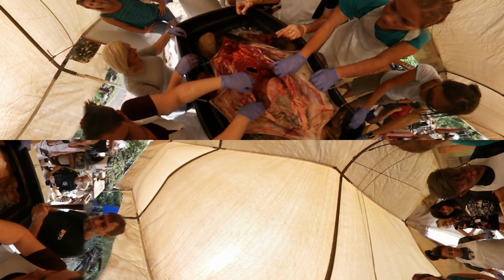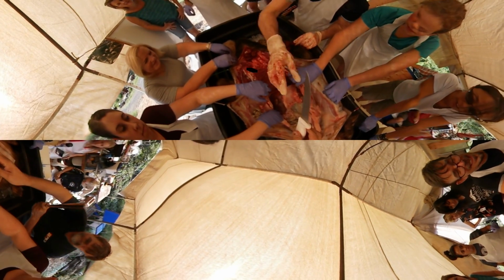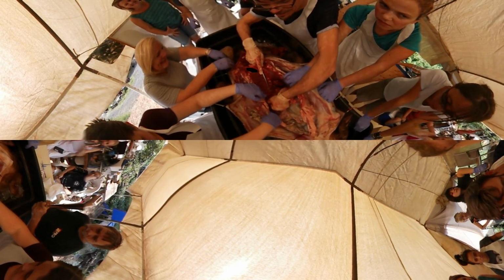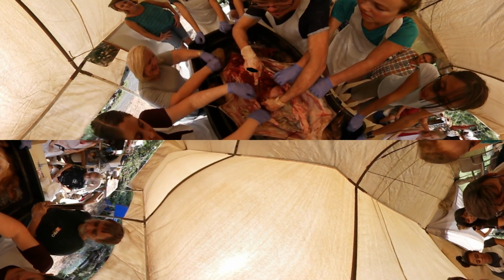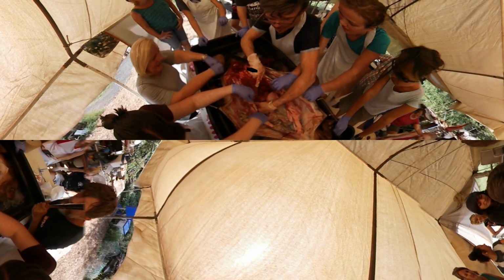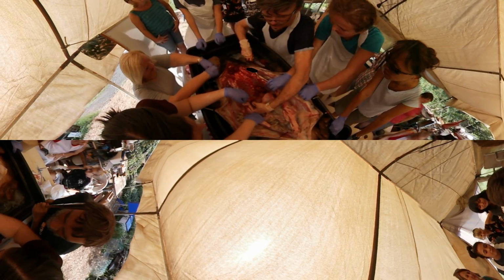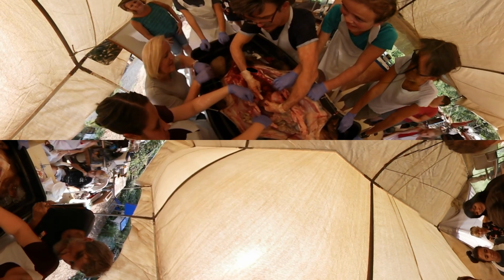Where's that knife? Let's cut into one of those, because there's not supposed to be lumps in the liver. So that would be, maybe brucellosis? We're going to learn about some of these things, aren't we? I'm just going to cut into this one here. I'm trying not to cut my fingers. Okay, oh, look at that. So that is not normal. What's coming out? It's like oozy stuff.